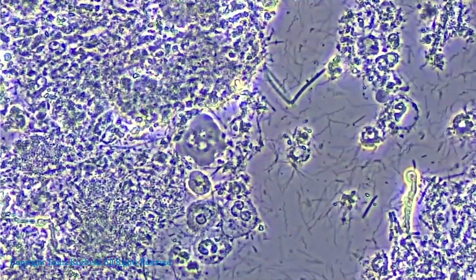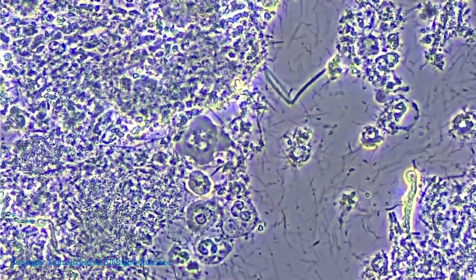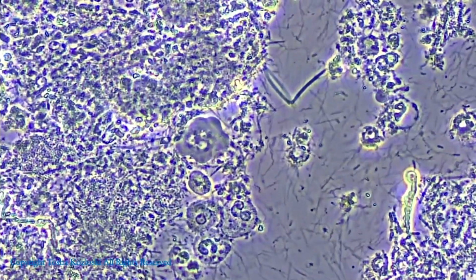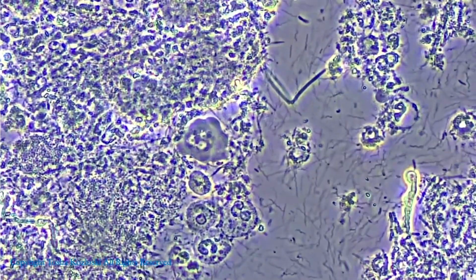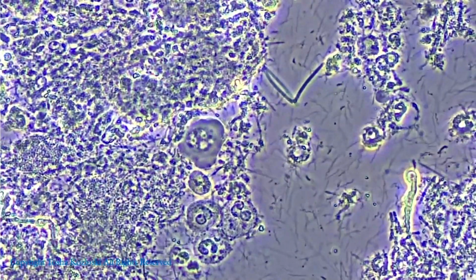We can really see the battle going on with those spirochetes. They're just having a feast right there, tearing apart that white blood cell. Amoeba kind of growing in there, all these white blood cells down here as well. And within the plaque mass, we'll also see a lot of activity in there too. So whenever we're looking at slides, we just go to that fluid space to see what's swimming around and what's chilling out in there.